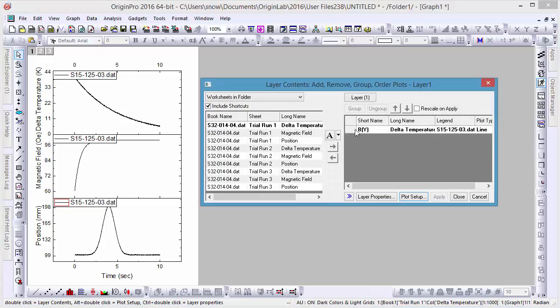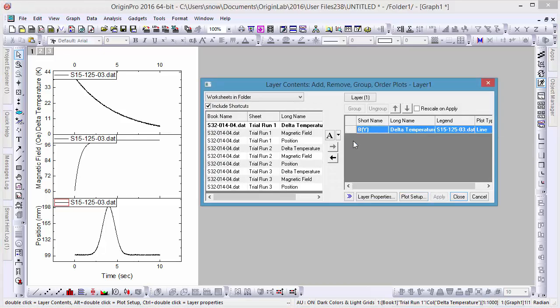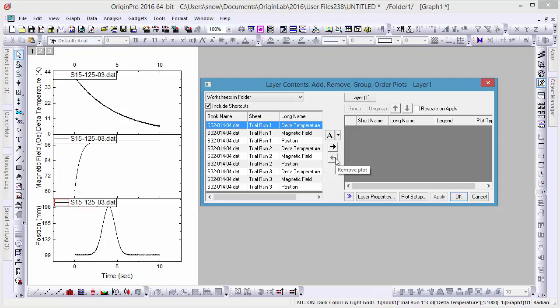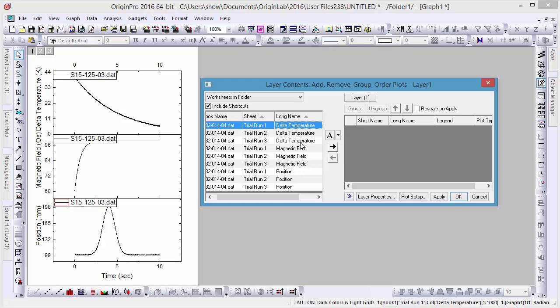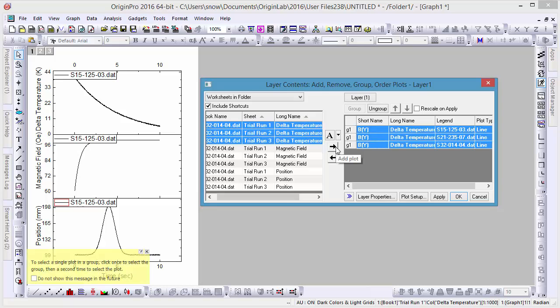First, let's remove our current layer and sort the long names of our plots descending to display plots for the change in temperature of all three trials. Let's add all three trials to our layer as a grouped set of data and click Apply.